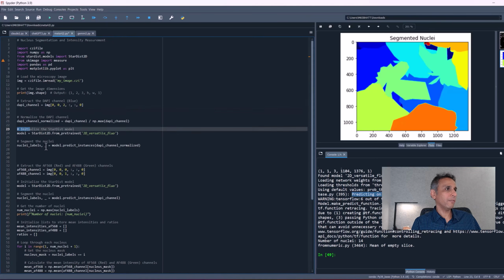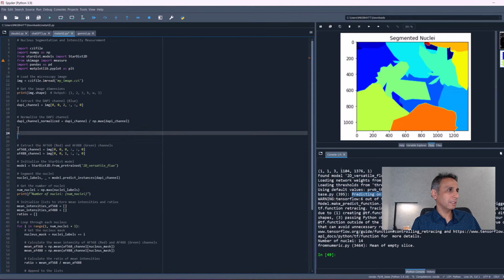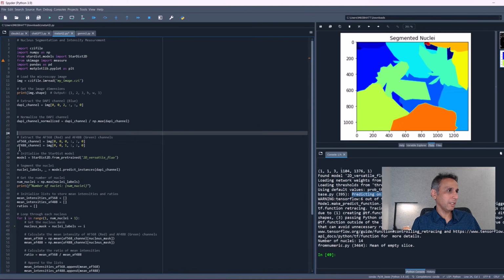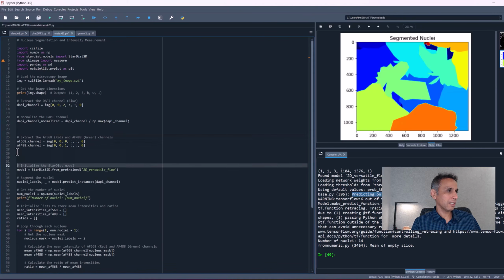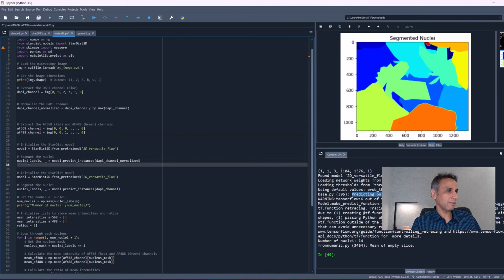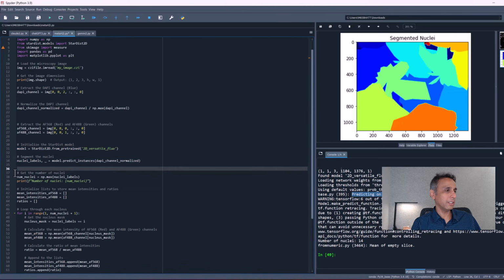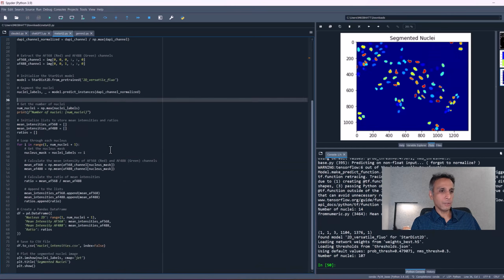It's a traditional way of normalizing it. It's okay, it doesn't matter, as long as you normalize. Anyway, it should be good. Everything else is good. Model.stardist to be pre-trained. Okay. No, we don't need that. We have it down here. So let's delete these lines and keep the ones above. Or you can ask the chat engine to give you the full code.